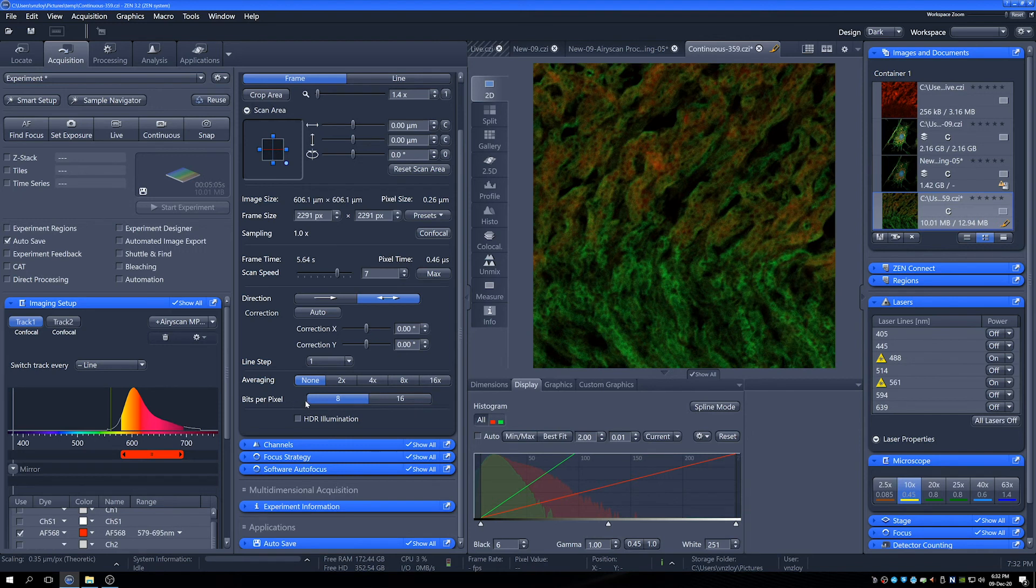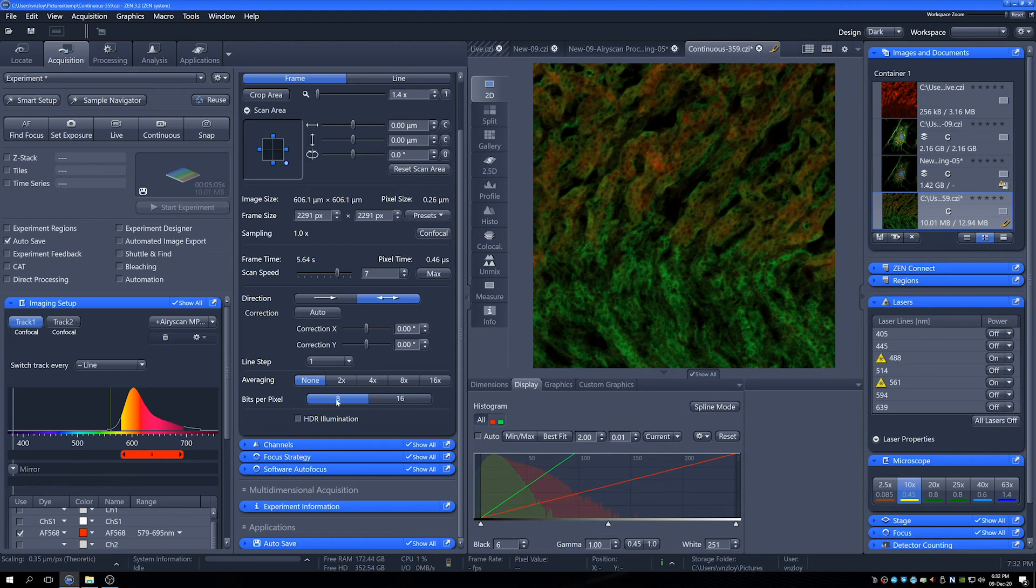If you're taking images where you're just looking at spatial organization of cells or proteins or whatever, then 8-bit is fine. But if you're going to do anything that's for quantitative nature, then 16-bit is the way you want to go.